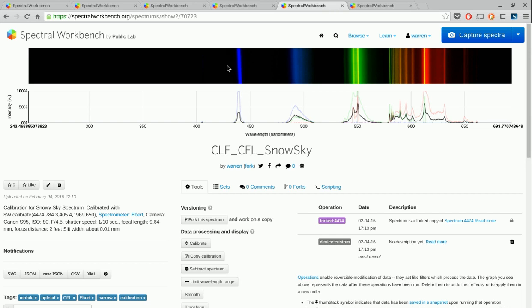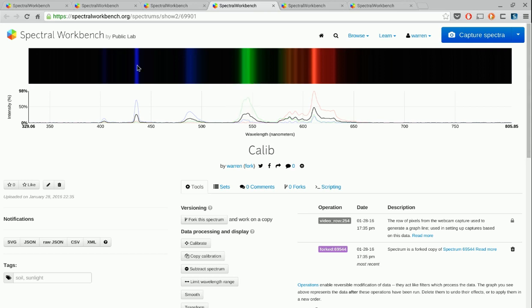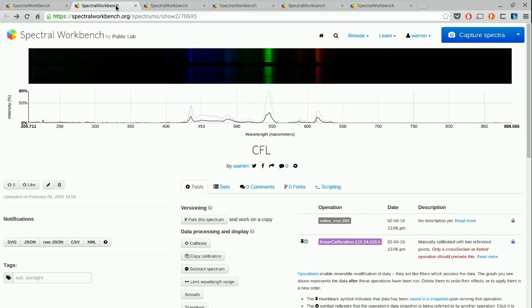So you notice you have this sharp blue line, a blurred blue line, a wide or when it's good resolution, a double green line. And then a bunch of other lines sort of mushed together here that are harder to make out. Going back to the one that I used, here's the sharp blue, here's the faint blue, here's the double green, and here's some of that red.